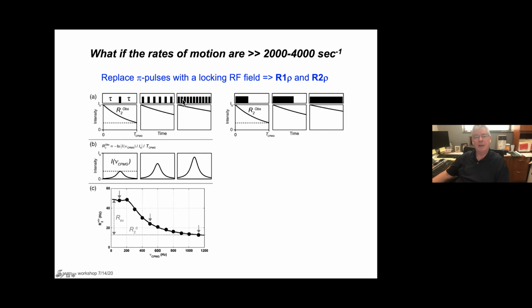What you see there is, rather than do this, let's just put it on CW, and you'll see the R2s actually lengthen the longer it's spin locked, and that's equivalent to never letting the tracked guys get far away. You just hold them right there, but they're still interconverting, and they will project that interconversion onto this relaxation behavior. Okay, so this extended the time scale significantly, but there are some difficulties.